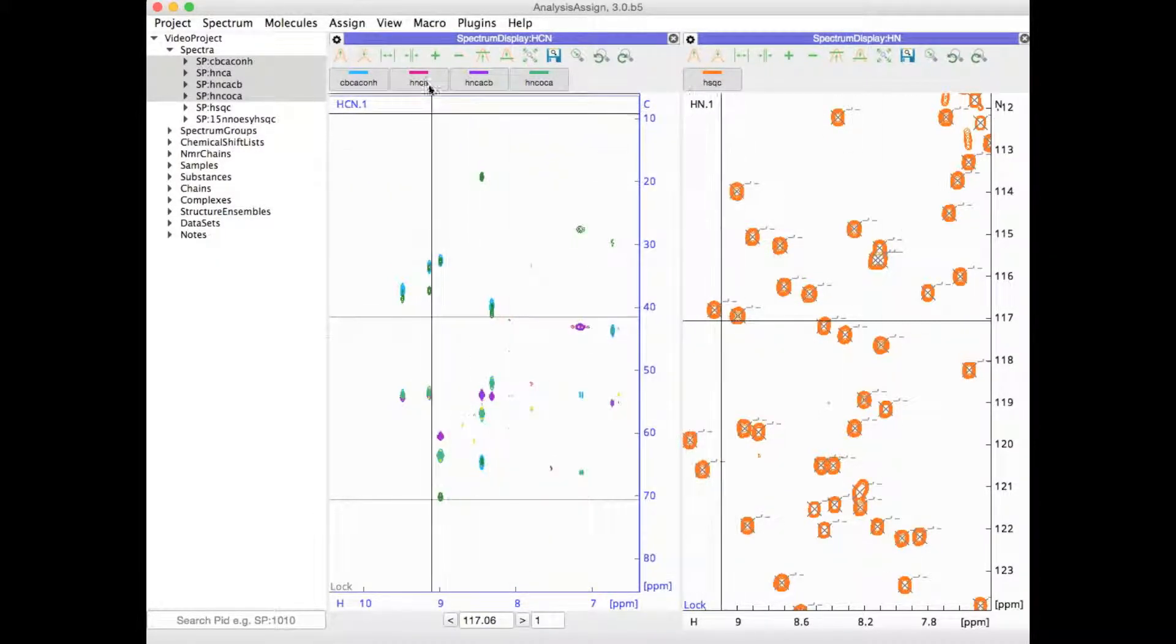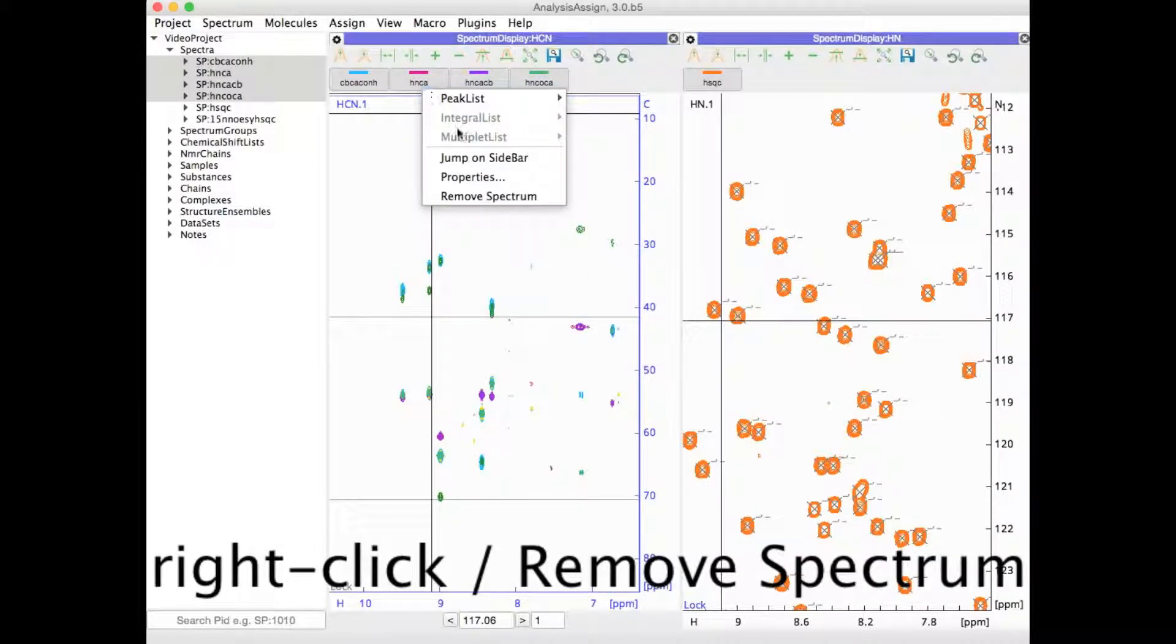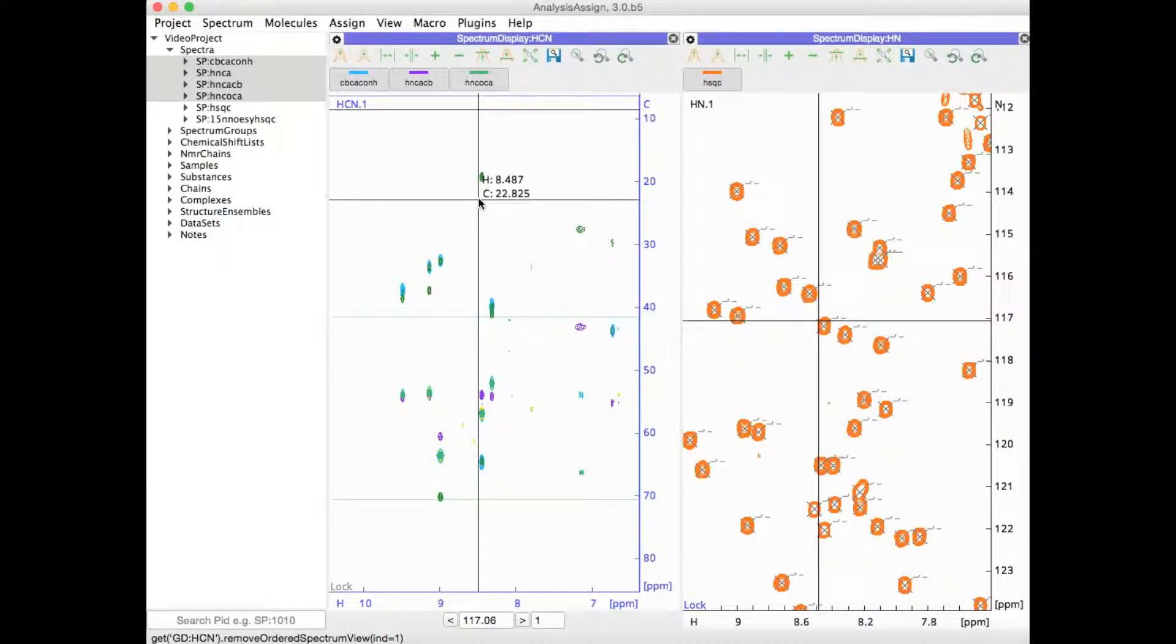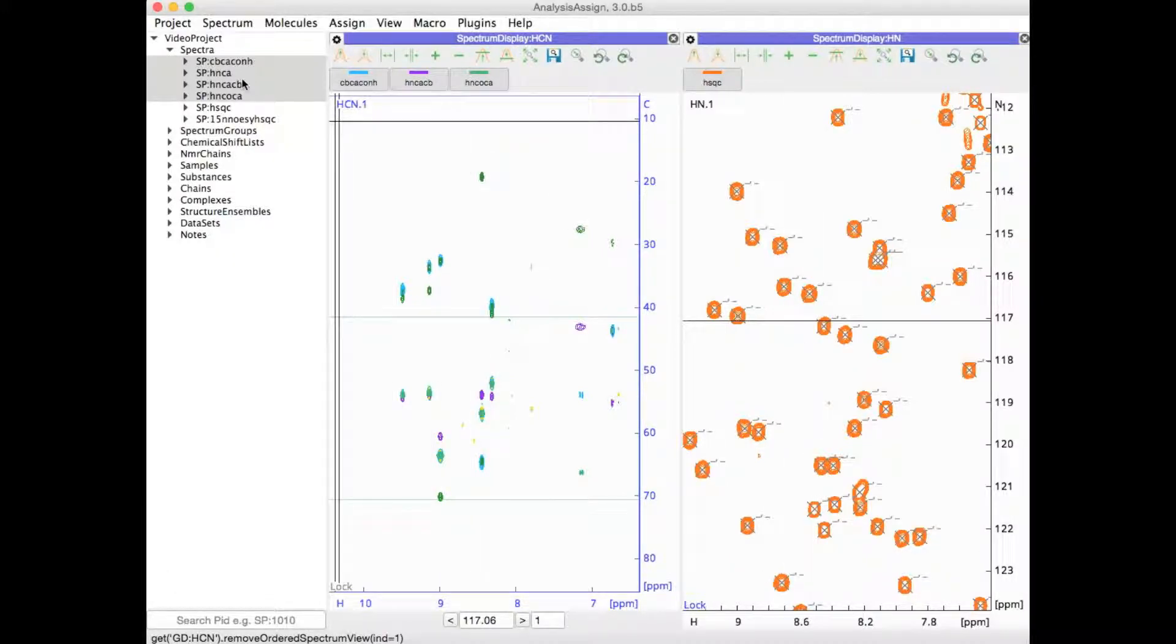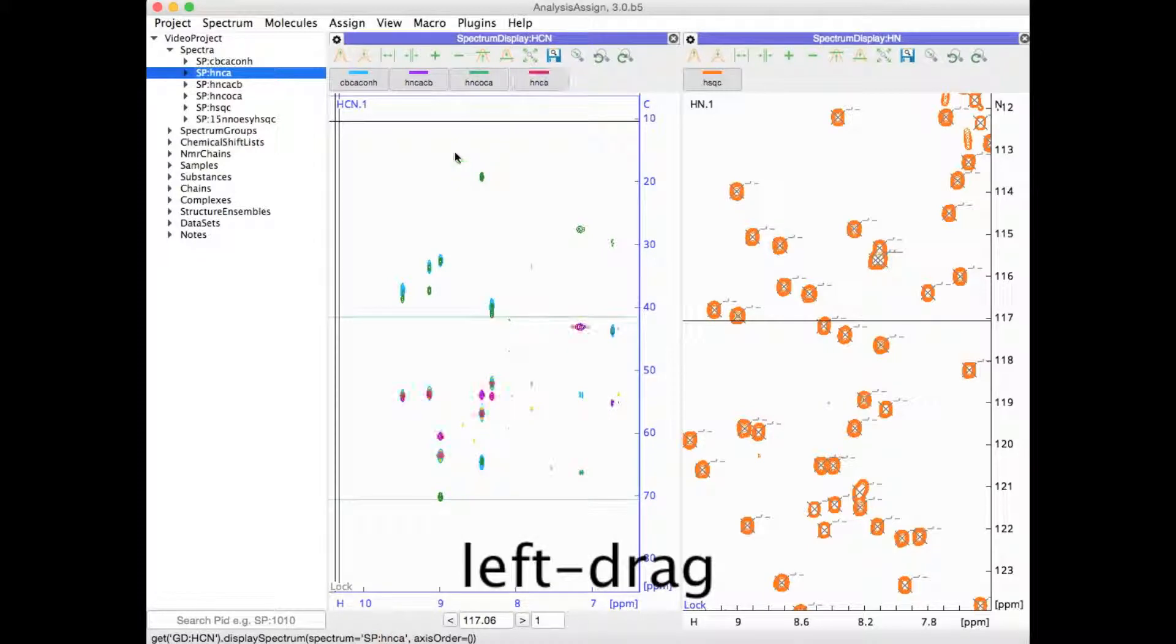If you want to remove one of the spectra simply right click on it and go to Remove Spectrum. You can then add it in again by clicking on the spectrum in the sidebar and dragging it back into the display.